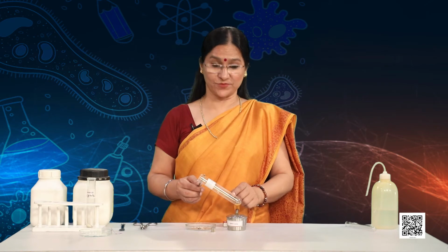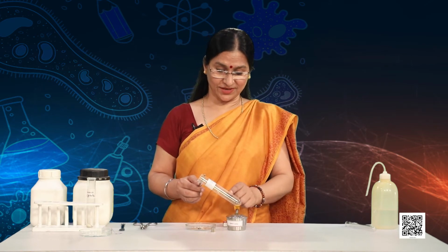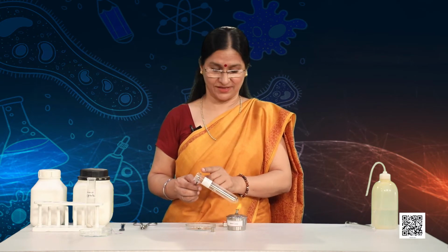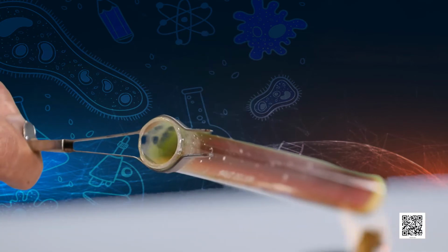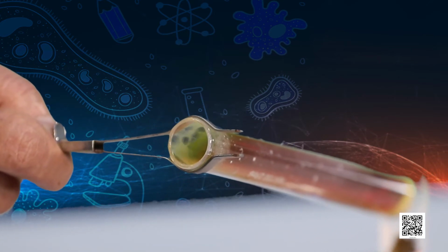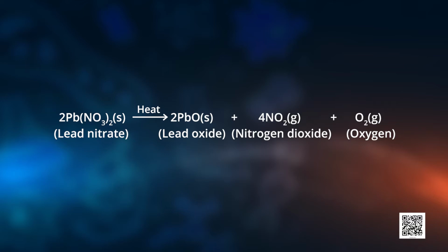Emission of brown fumes can be seen. Look here and be careful. Never inhale them directly. They can be harmful to you. I hope you are noting your observations. These fumes are of nitrogen dioxide. Lead nitrate has decomposed into lead oxide, nitrogen dioxide and oxygen.